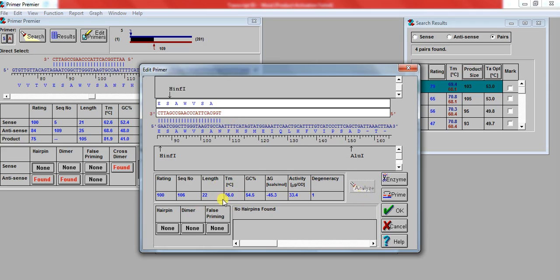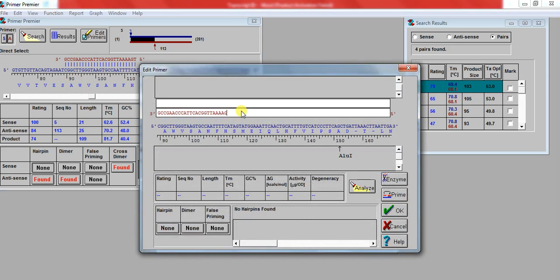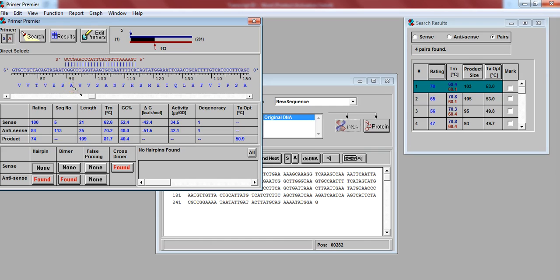No, so here the temperature is a little bit high. If the temperature is too high, we can reduce that from here. After deleting every base pair, you analyze it to check. If the base pairs are too low, so no, it is not. We try another one.